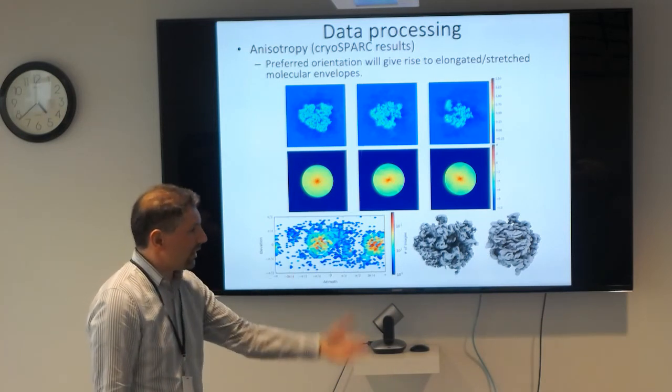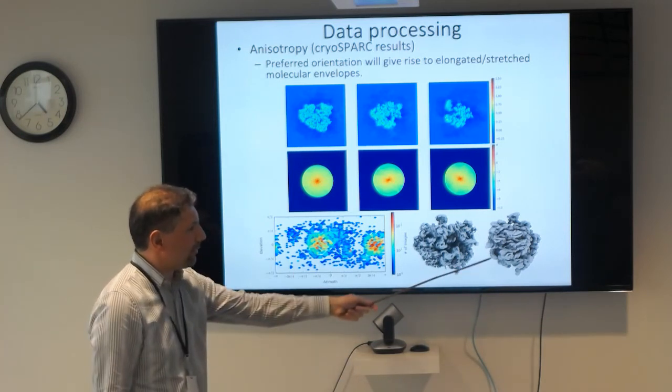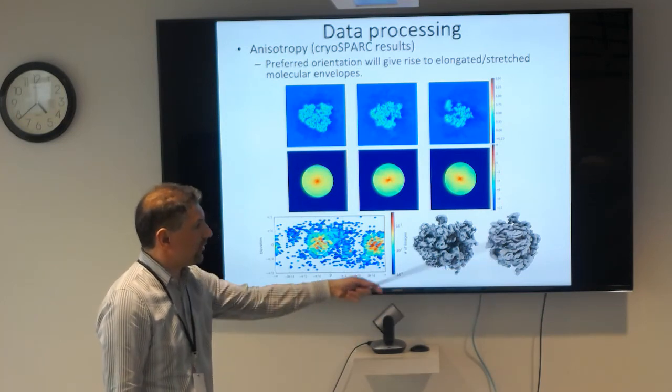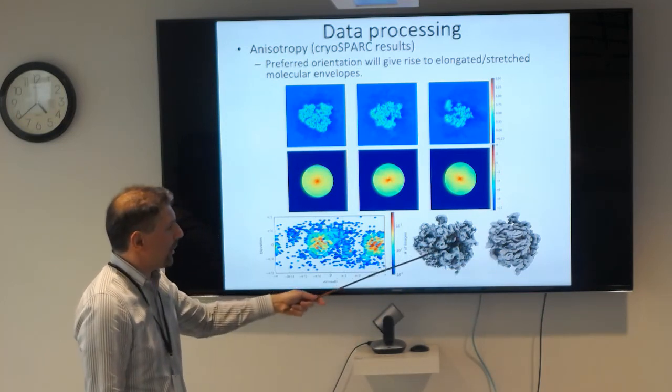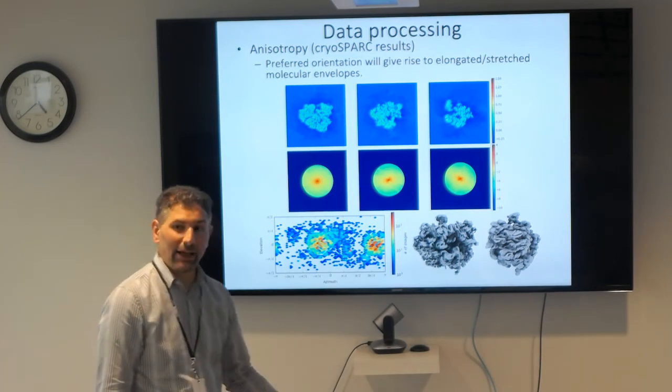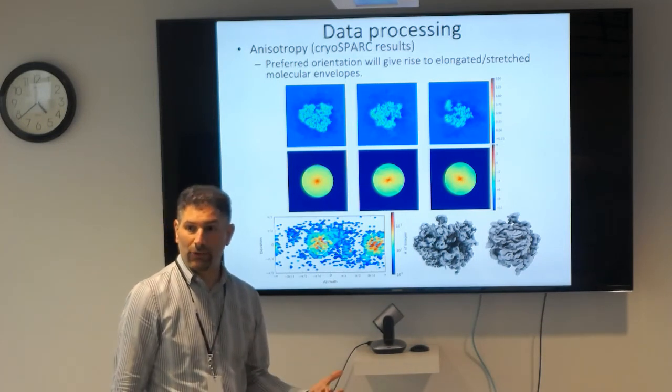So when you're trying to align particles to a smeared out, bad reference, for example if one model was more anisotropic than this, then all the garbage is going to go into that, whereas the rare views are going to go into a reconstruction that does not have the preferred orientation, right?